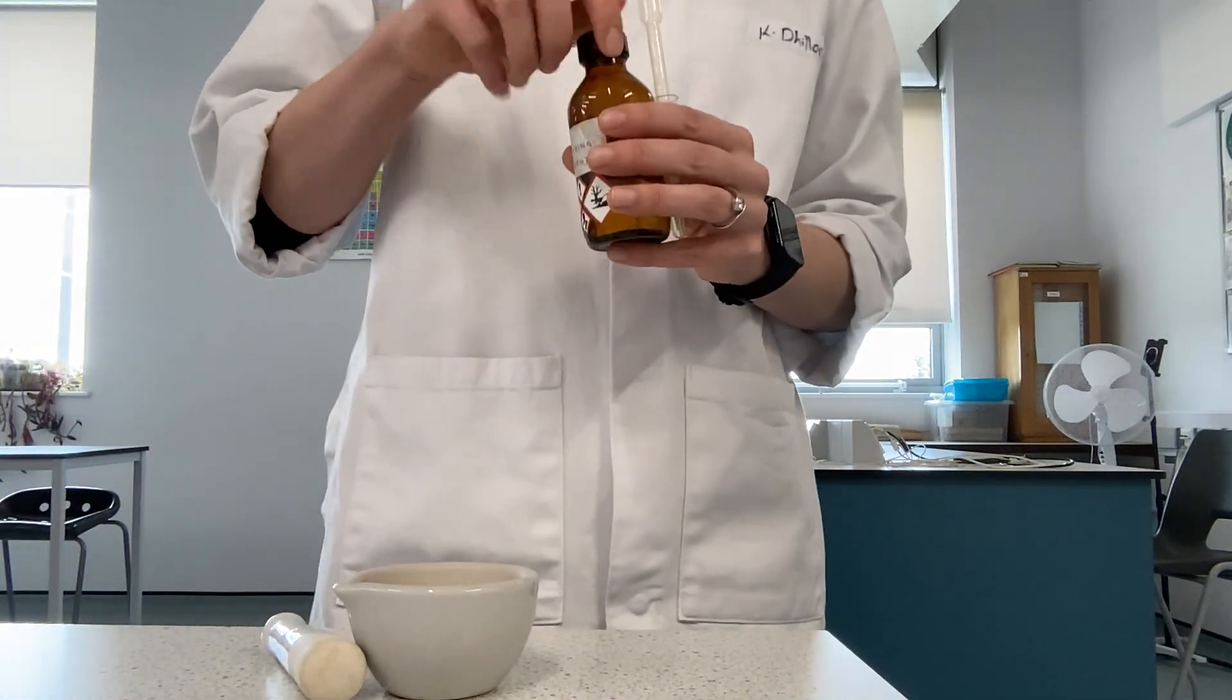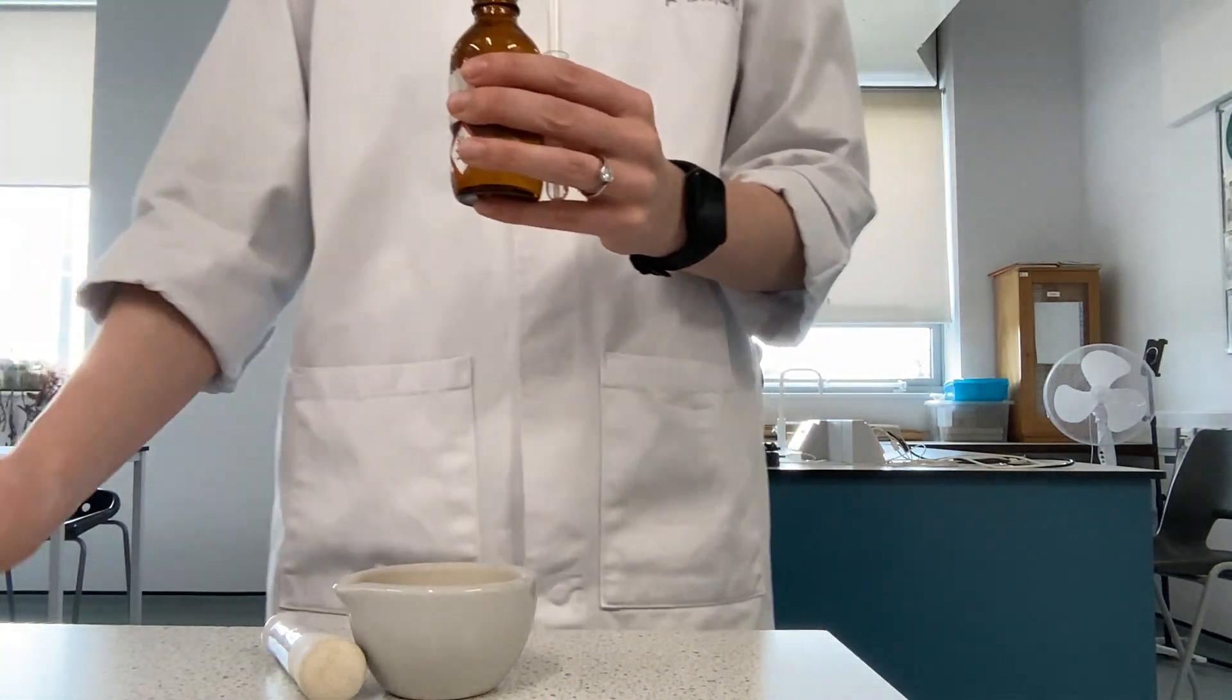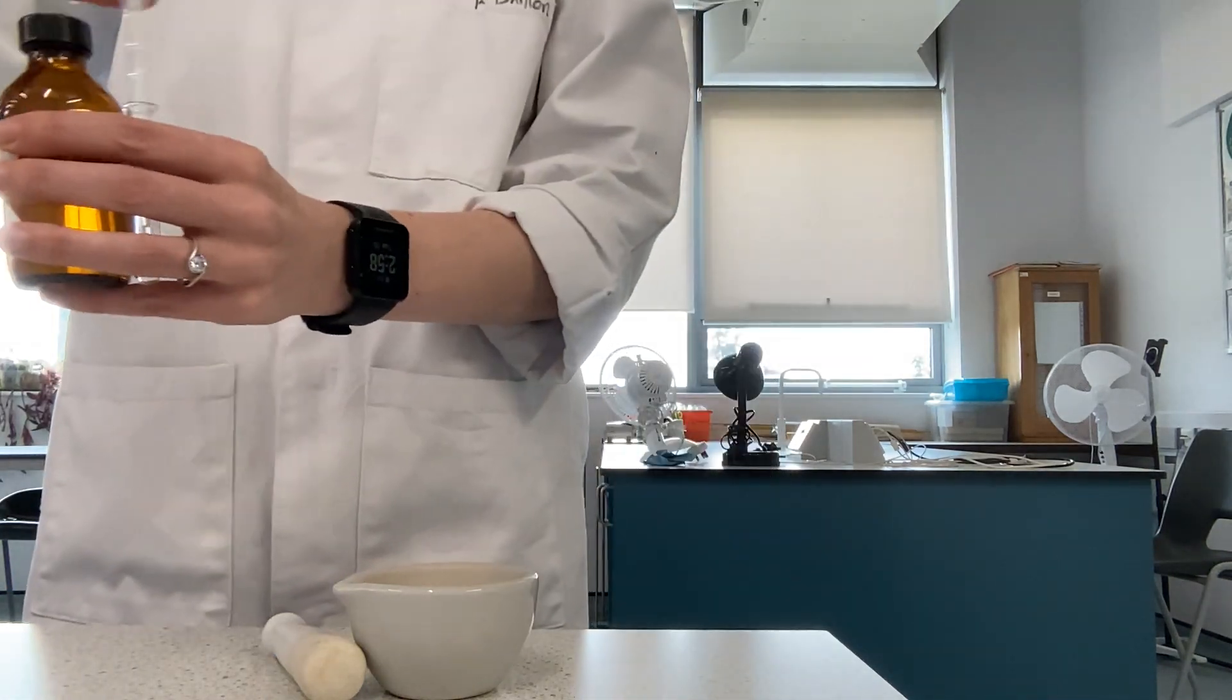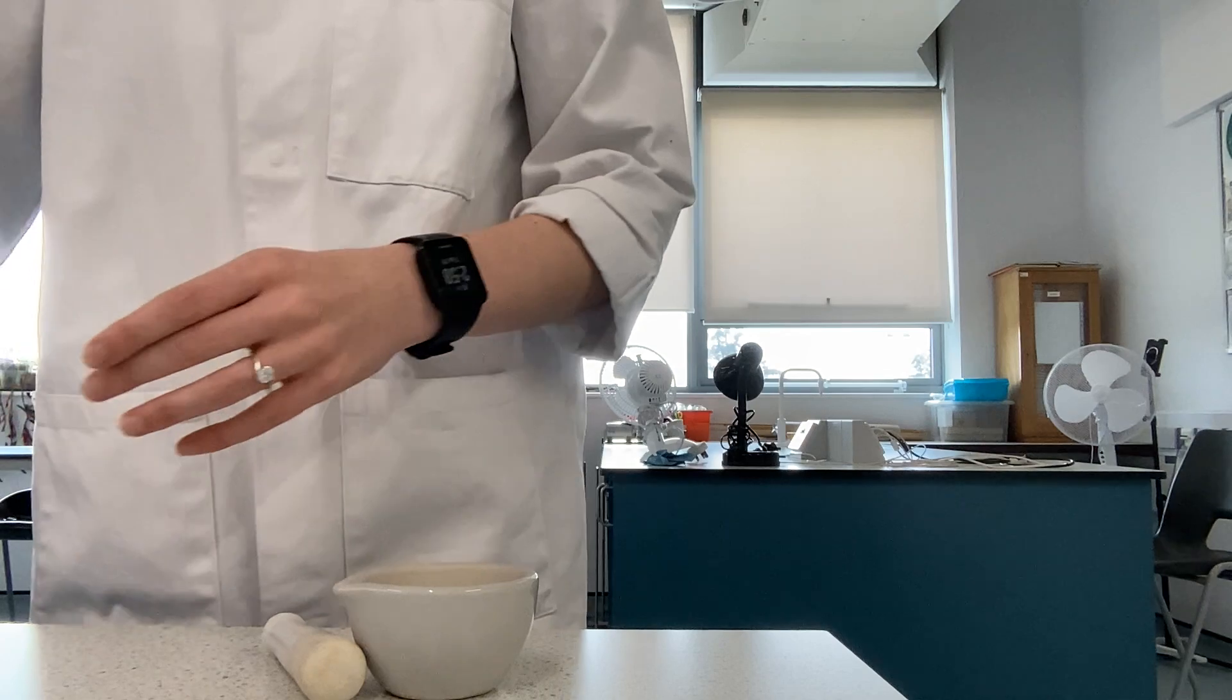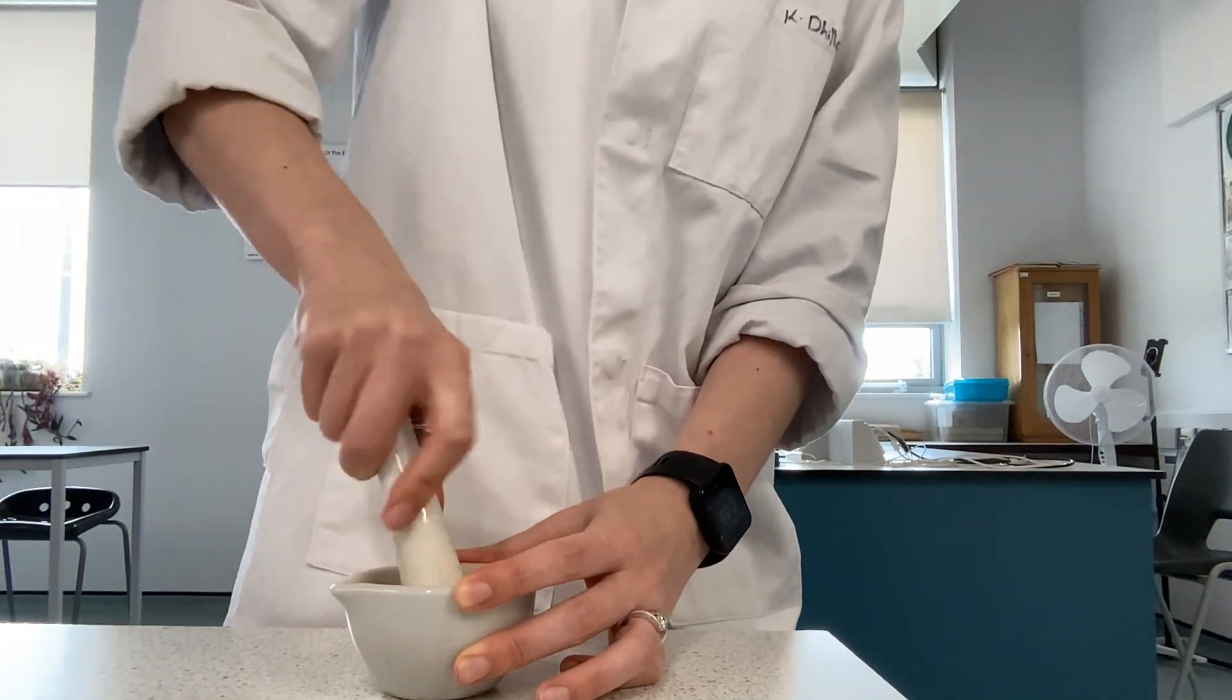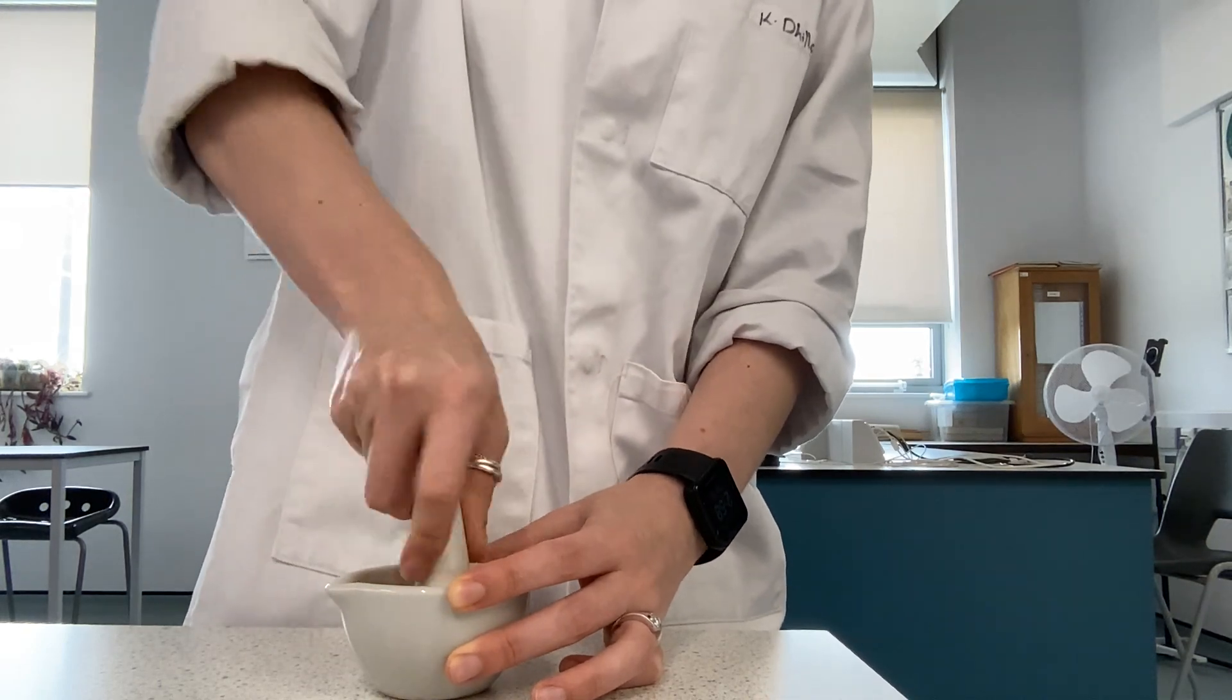What we will then do is use a pestle and mortar to get a smooth pulp. I'll get my pestle and mortar and grind the leaves up until I have a smooth pulp.